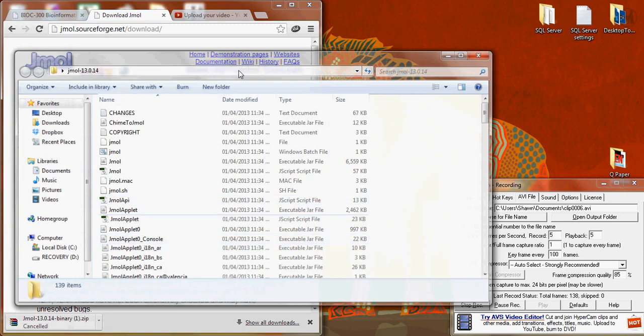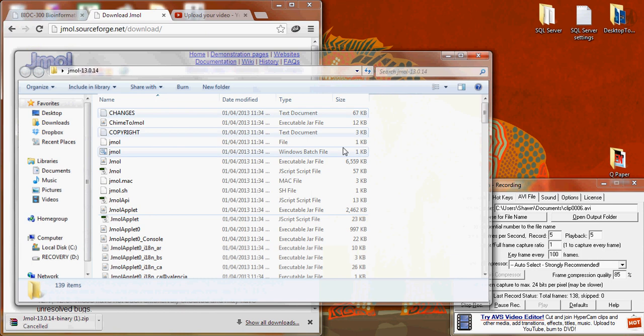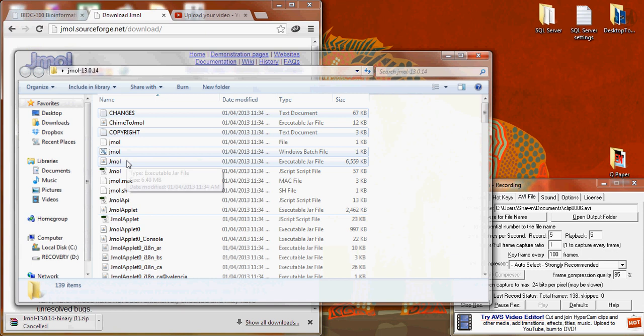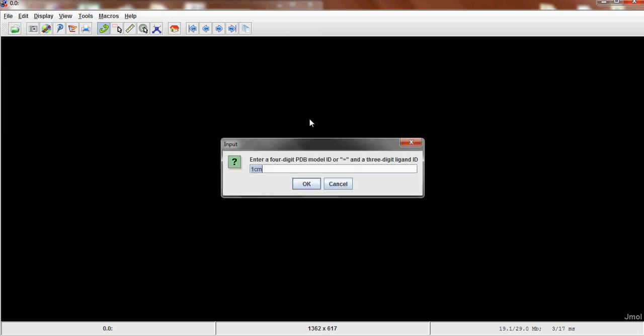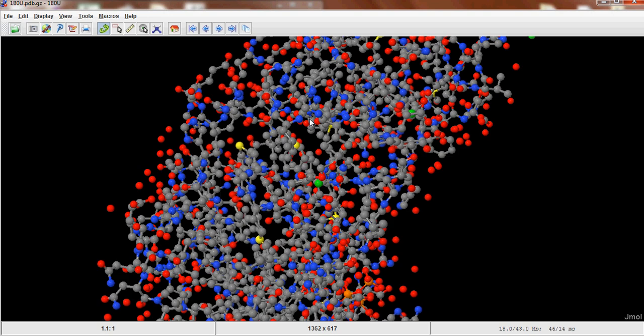Now as long as you have Java installed, you can use the jar file here, jmol.jar. So if you open this up you'll get the JMol program. If you click File, Get PDB, you can then type 1B0U and you'll get the ball and stick model for your protein.